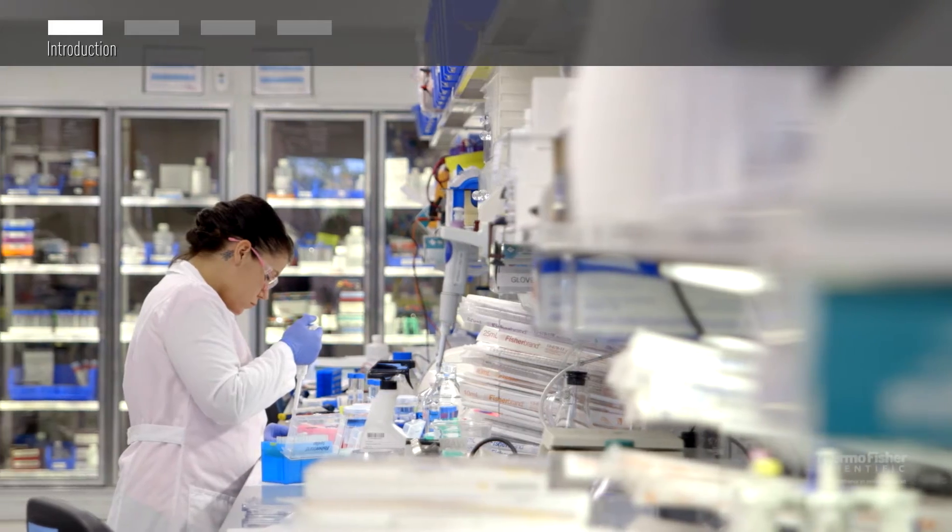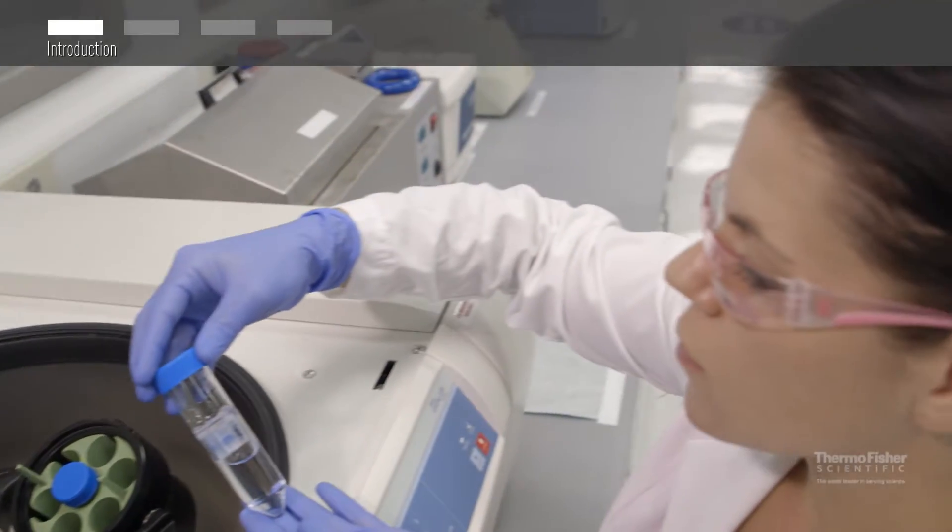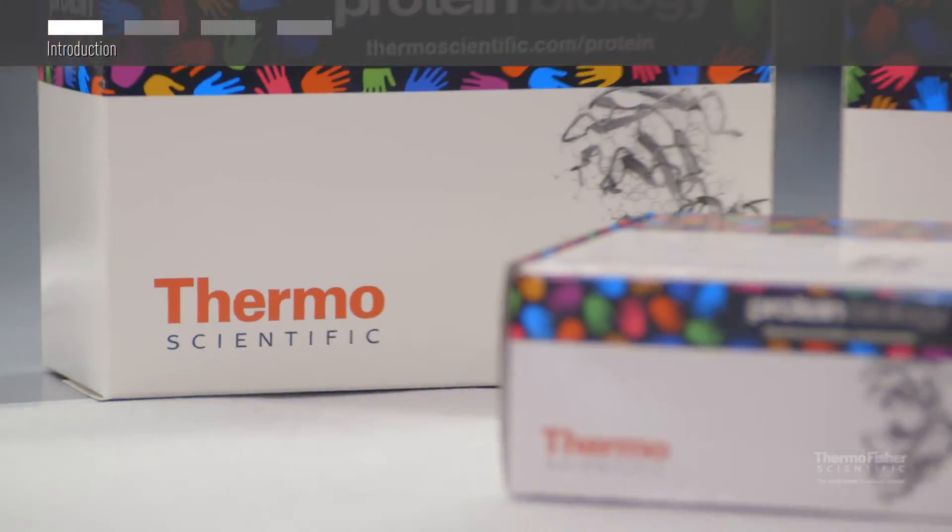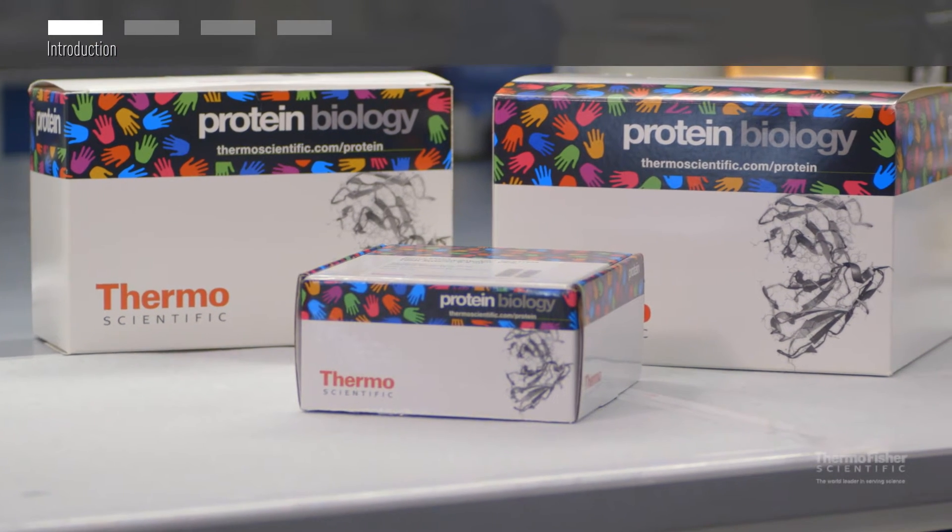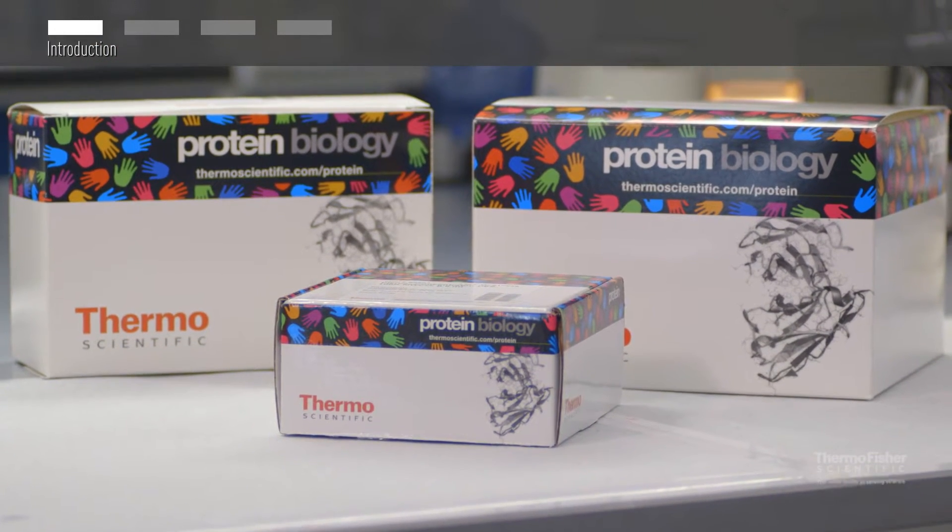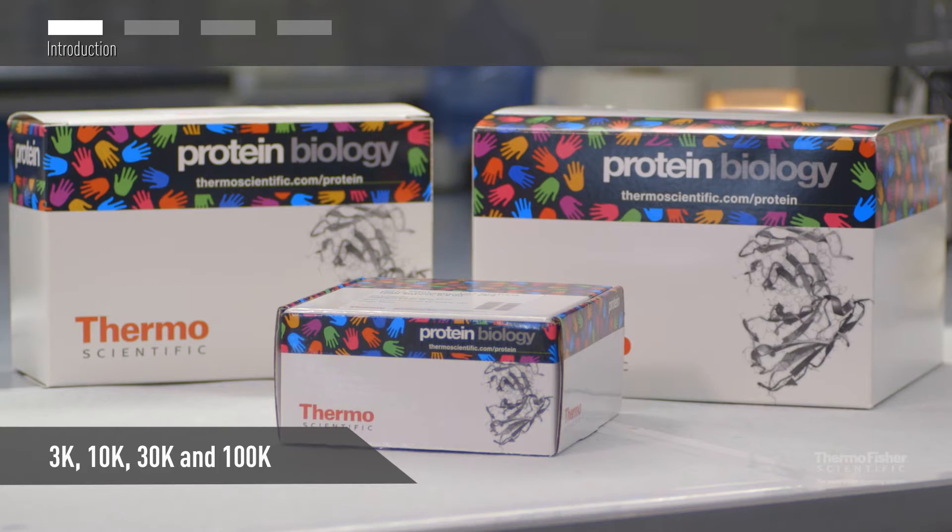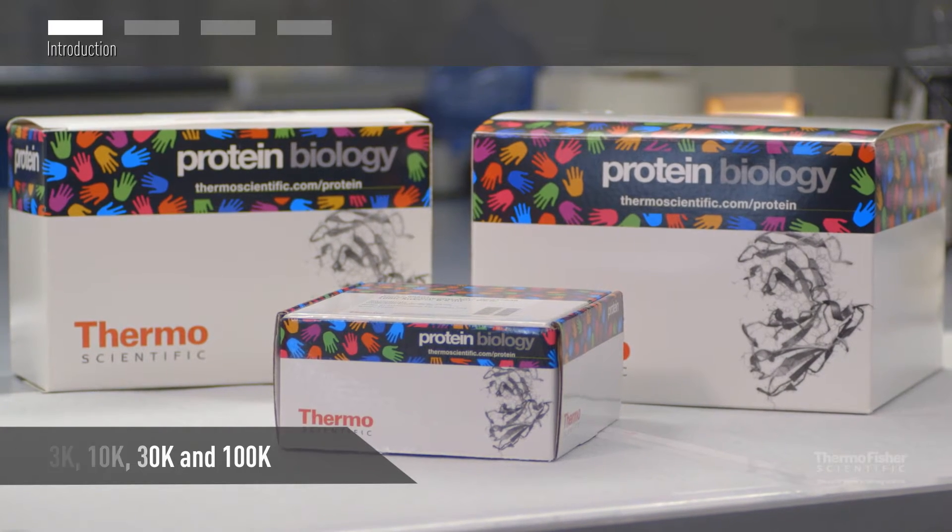These disposable devices are conveniently used in a benchtop centrifuge. They contain polyethersulfone or PES membrane in a variety of molecular weight cutoffs including 3K, 10K, 30K, and 100K.